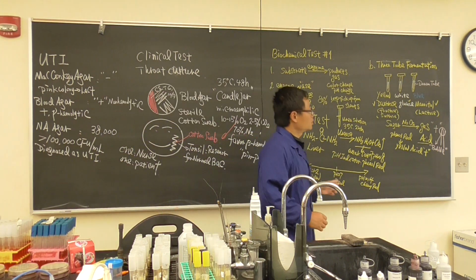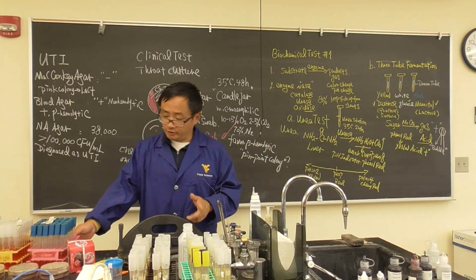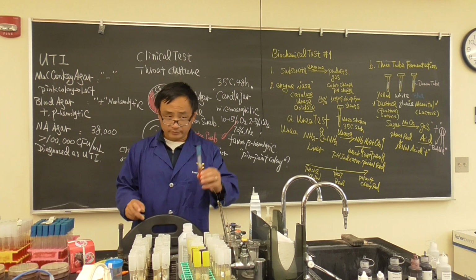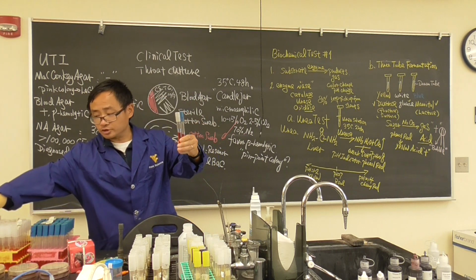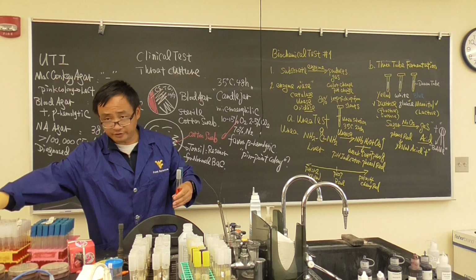Okay? So today's work is also very simple. For the 3-tube fermentation test, everybody will get mannitol, glucose, and dextrose. Now there is a lab safety issue.